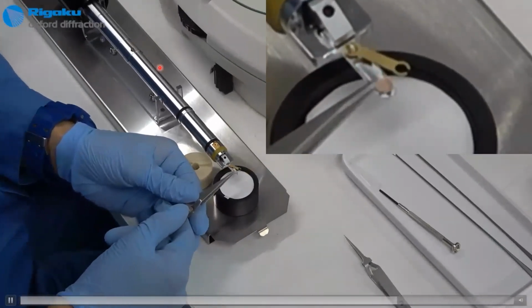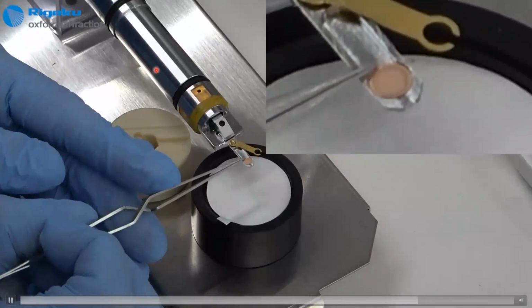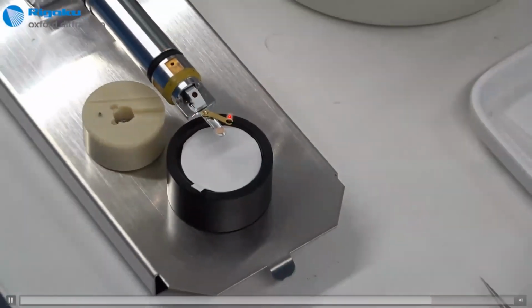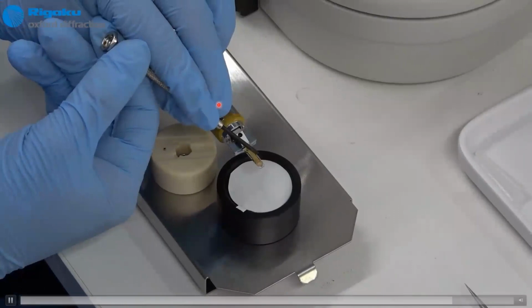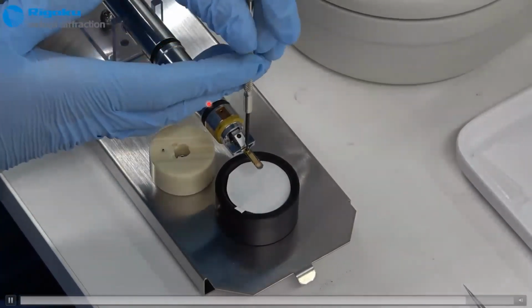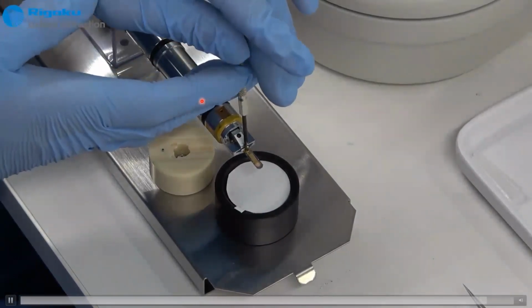This is the part that in the end will move this grid into the vacuum of the electron diffractometer. The grid is mounted to the tip of it, just a very straightforward way into this cradle. And then using a retainer piece that you see here, which is closed shut, it is held in place so that it just doesn't, well, fall off when you rotate the grid during data collection.